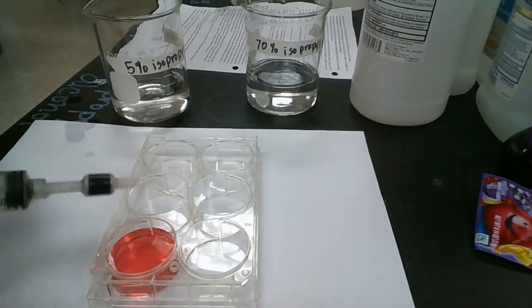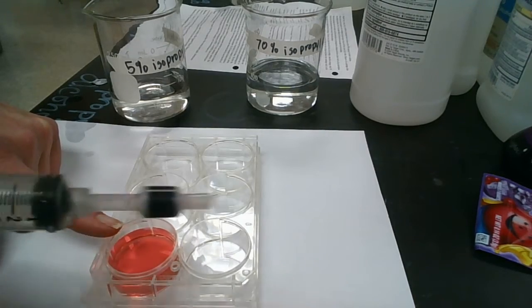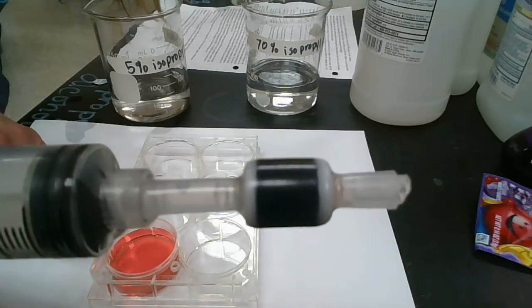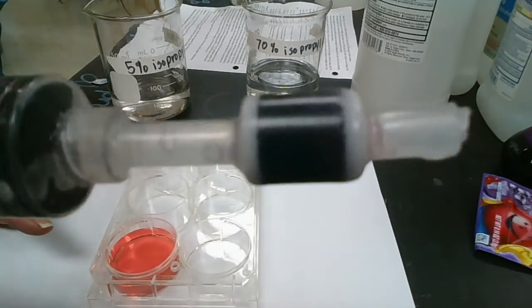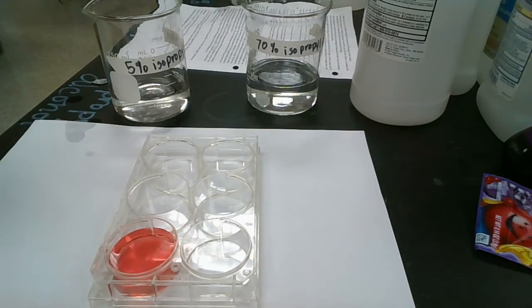All right, we're back with our column chromatography of Kool-Aid. And we've done our 5% isopropyl alcohol, and we've gotten our first compound off the column. And it doesn't look purple anymore on the column. It might be hard to see, but it only looks blue or dark blue tinge to me at this point. That suggests that we've got all this first red compound off the column.